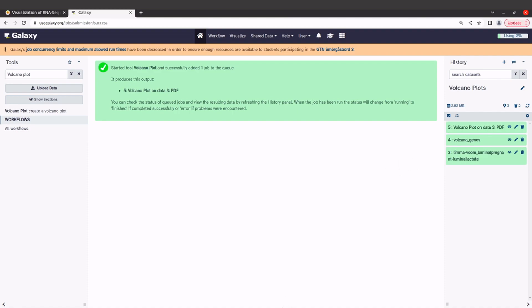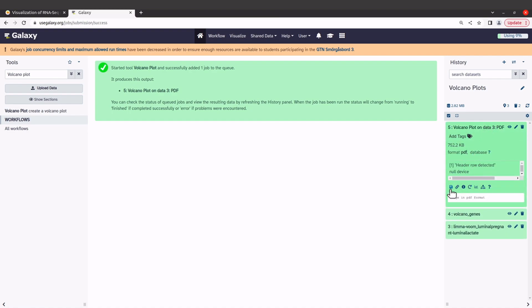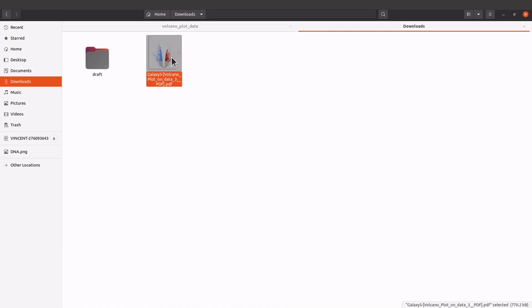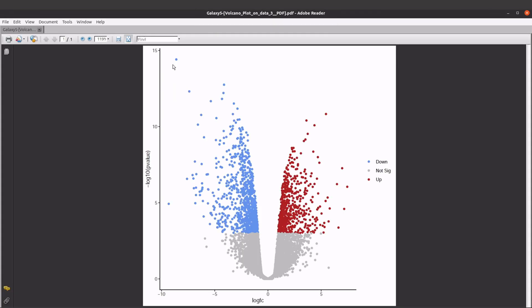The volcano plot has been generated. The output is a PDF file. To download it, click on the output, bring your cursor to the save icon, and click it to download the file. Opening the PDF, we can see a typical volcano plot: blue for down-regulated genes, gray for not significant, and red for up-regulated genes. I have separate tutorials discussing volcano plots in more detail — check the description box.